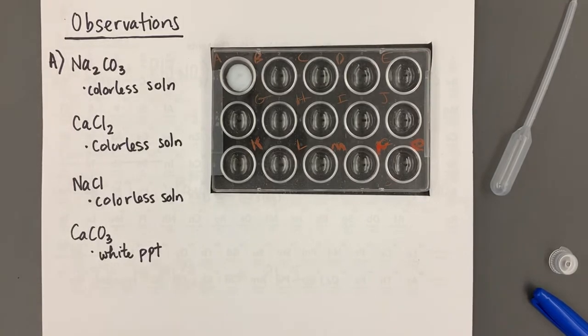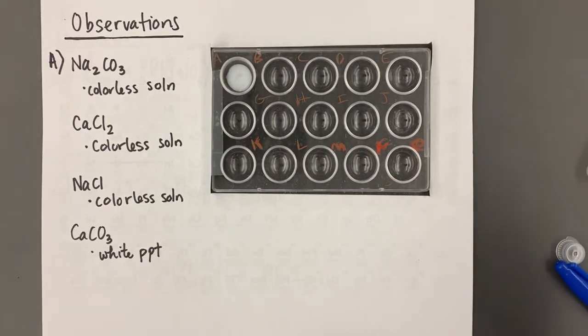Calcium chloride is a colorless solution. NaCl is a colorless solution. And calcium carbonate is a white precipitate. This first reaction should have already been filled out for you in the data sheet. So I'm just giving this to you as an example. All right.